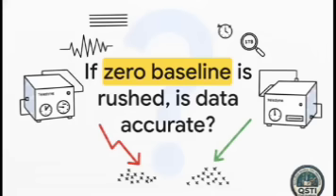As you prep your Teledyne T200H or T200M for testing, consider this final thought. Taking the time to let your zero and span baselines truly stabilize isn't just some annoying waiting period cooked up in a manual. It is the absolute, uncompromising foundation of everything you will measure next. If your zero baseline is rushed, is any measurement that follows truly accurate? Every single data point you collect afterward carries that initial error. So respect the NOx/STB reading, follow the steps precisely, and your data will speak for itself.